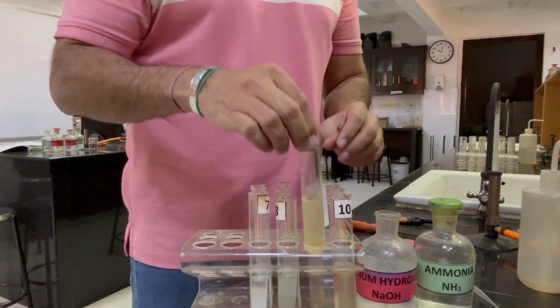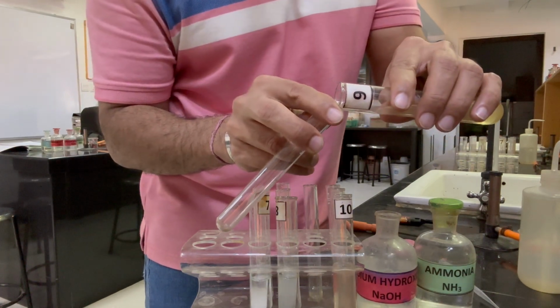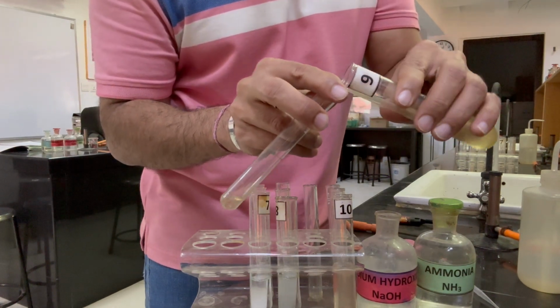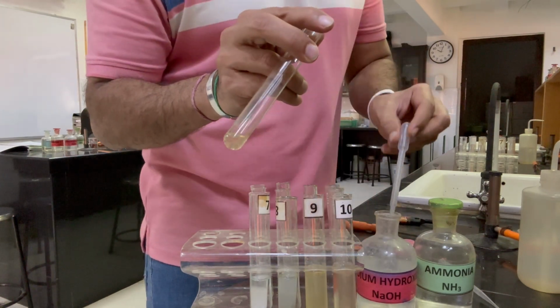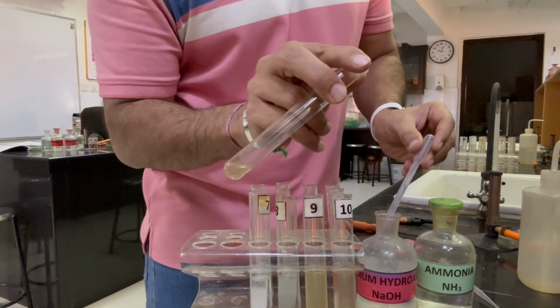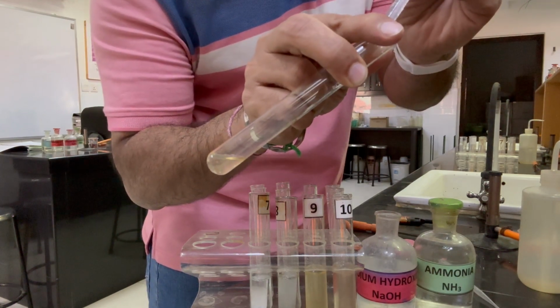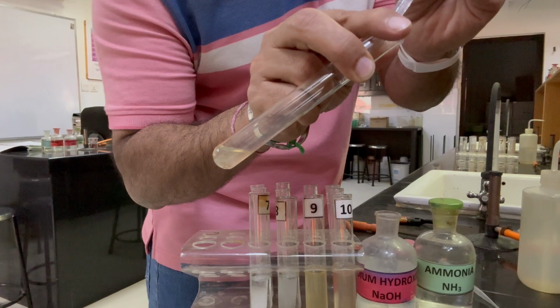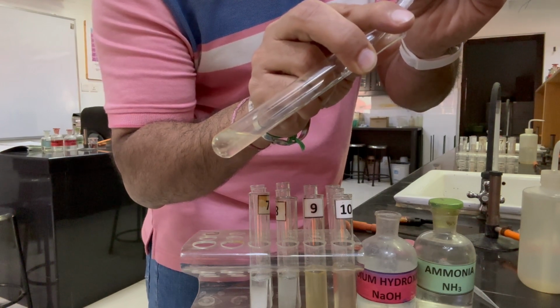Let's move on to the next chemical, that is FA9. We take 1 centimeter depth of FA9 and we add a few drops of sodium hydroxide, and we can see white precipitates are forming.